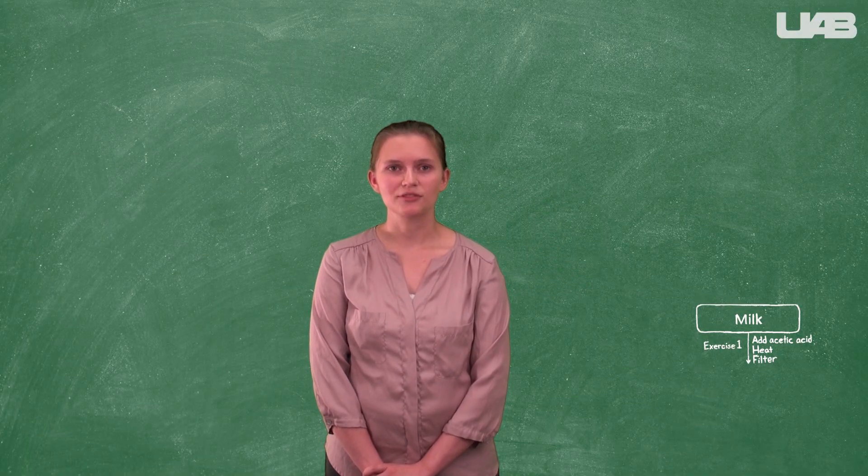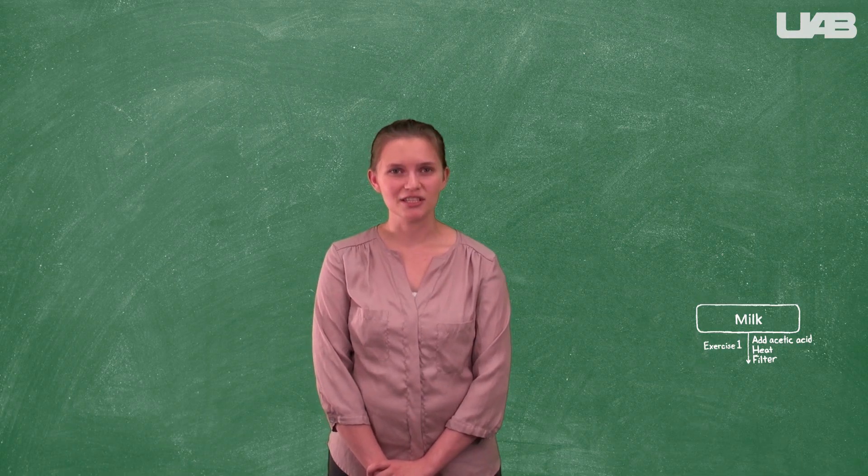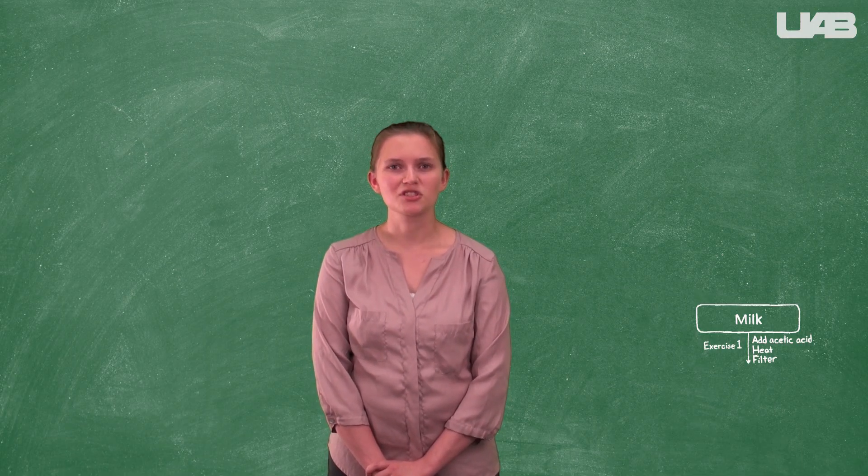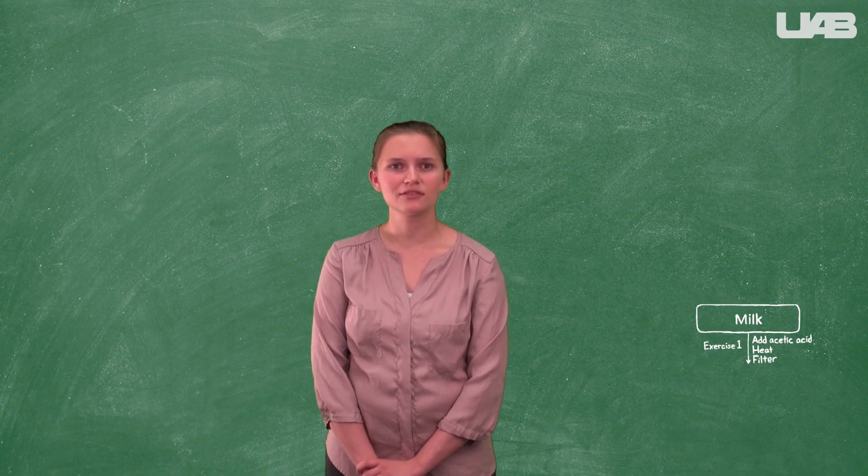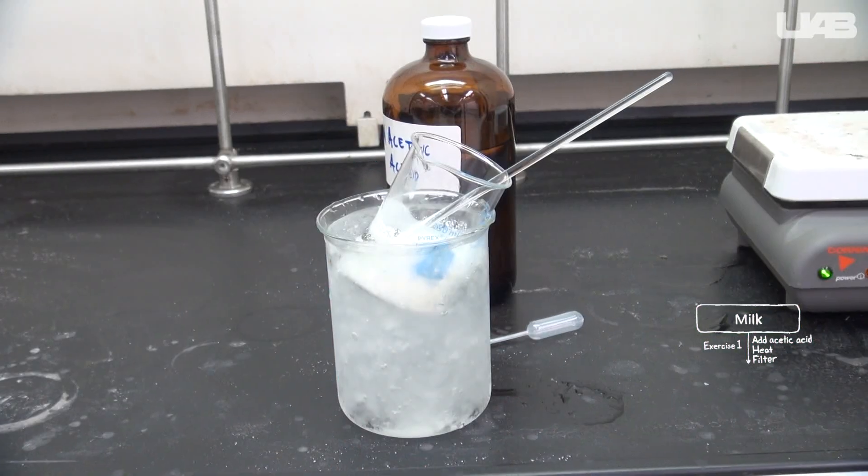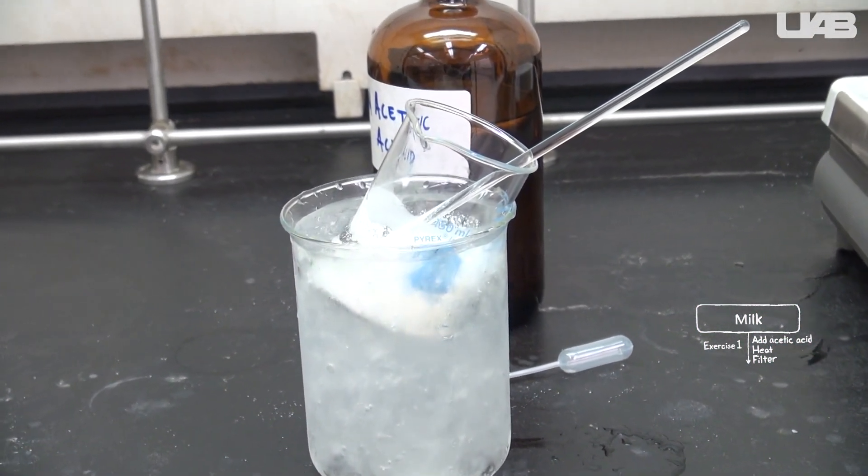If you fail to check your glassware for cracks, this is where you're going to be in trouble. Damaged glassware will shatter easily when it goes from being very hot to very cold. Let this cool undisturbed for about 10 minutes.